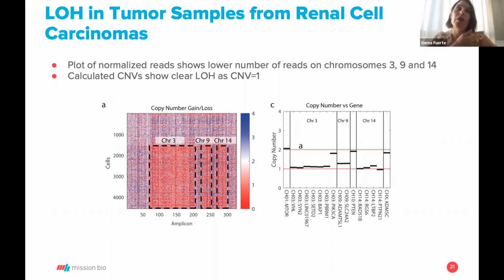Yeah, that's a question that we get very often. We have tested internally that as little as 5% of a normal population will be enough for you to call copy number. If you are working with a high tumor burden sample or a pre-sorted population, so you expect 100% to be tumor, a solution that you could do would be a spike-in.